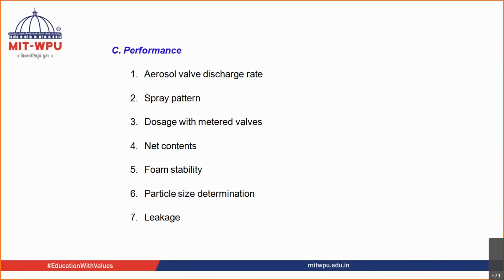Performance of your container as well as your aerosol. Okay, so how do you determine the performance of your container? The performance of your container is tested by aerosol valve discharge rate. You test the spray pattern.